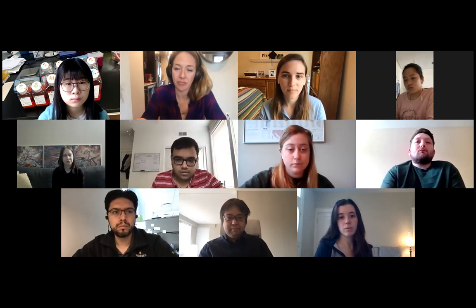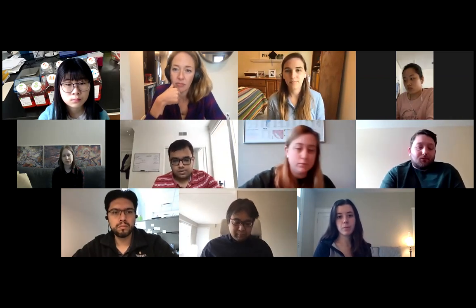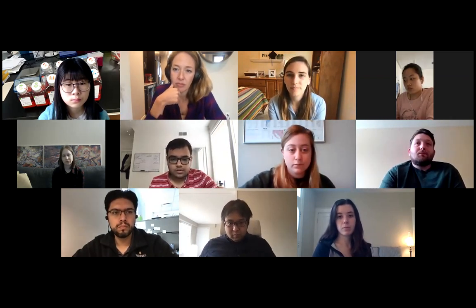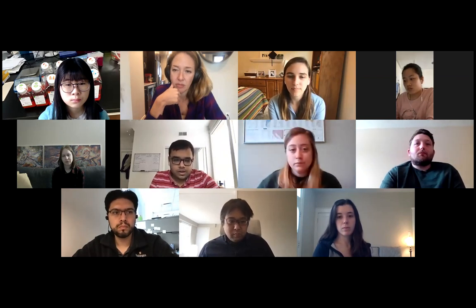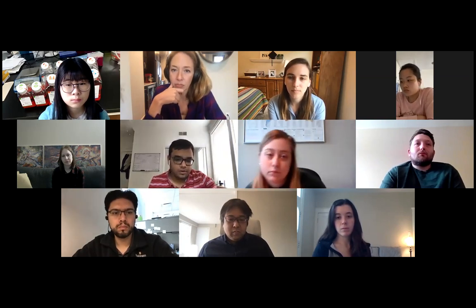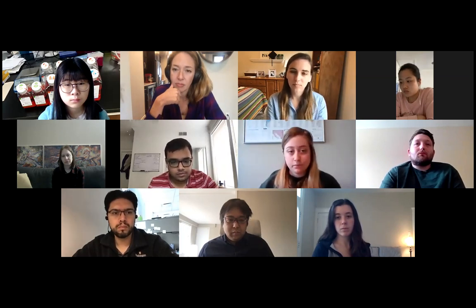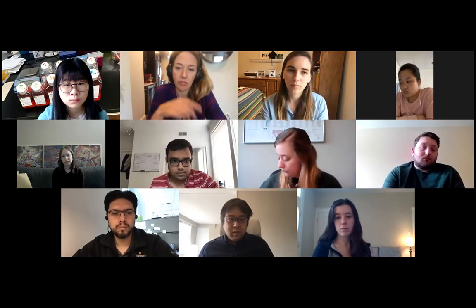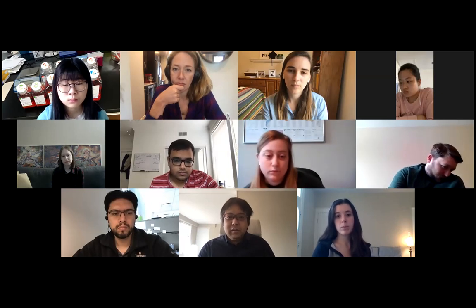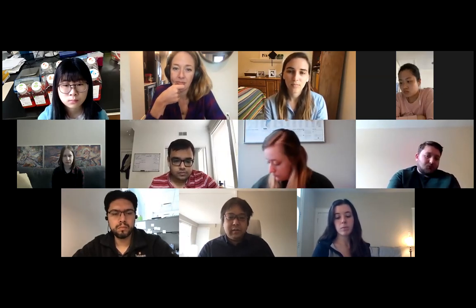I had a question, Kenji. The data which you have been using for all of these analyses, is that available as a pre-processed CellOracle object which you can directly load and use? Or if we have to do the same analysis with your data set, will we have to start with the count matrix or something? Yeah, the single cell data I'm using here is available.